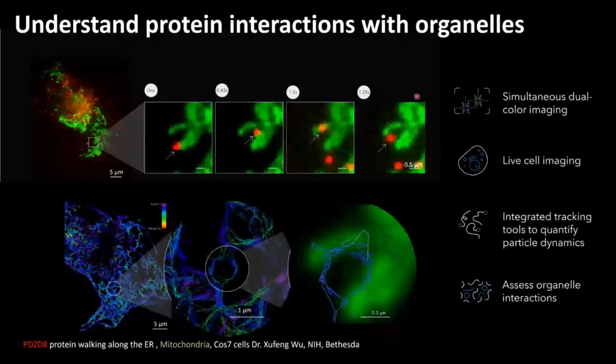And so this was done with simultaneous dual color imaging of both PDZD8 protein as well as a mitochondrial marker using live cell imaging, and the tracks were performed using our integrated tracking tools to quantify the particle dynamics, which allowed us to assess the organelle interactions.